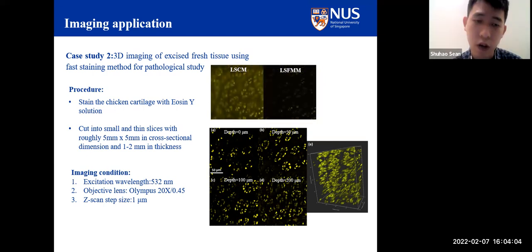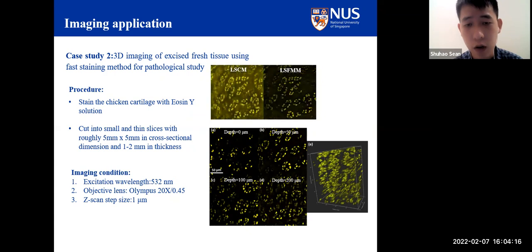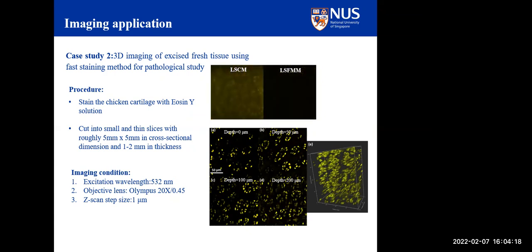So it is a very good direction to investigate whether the clearing will cause any damage. I mean, the clearing definitely will not... I think it will kill the cells.